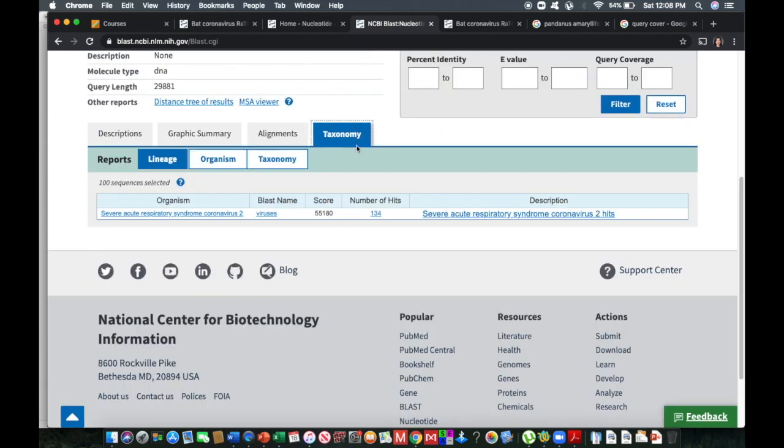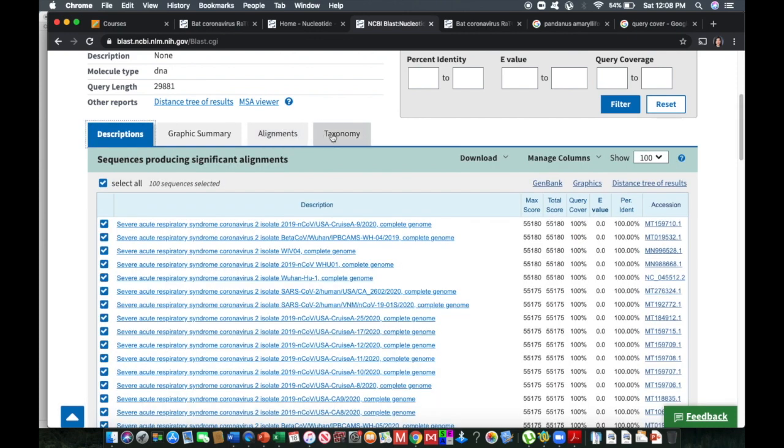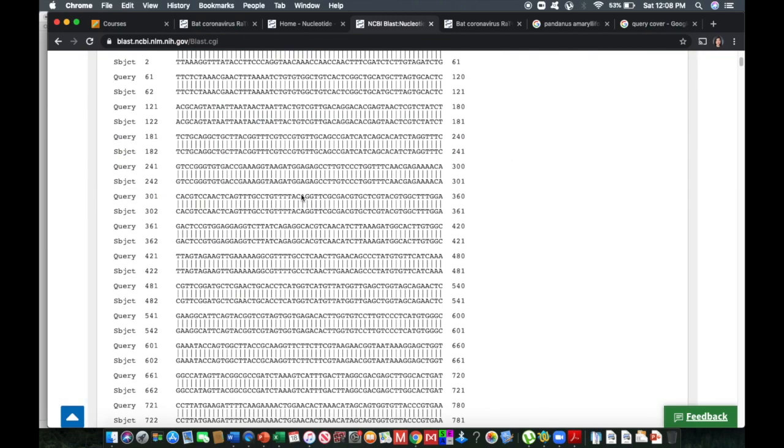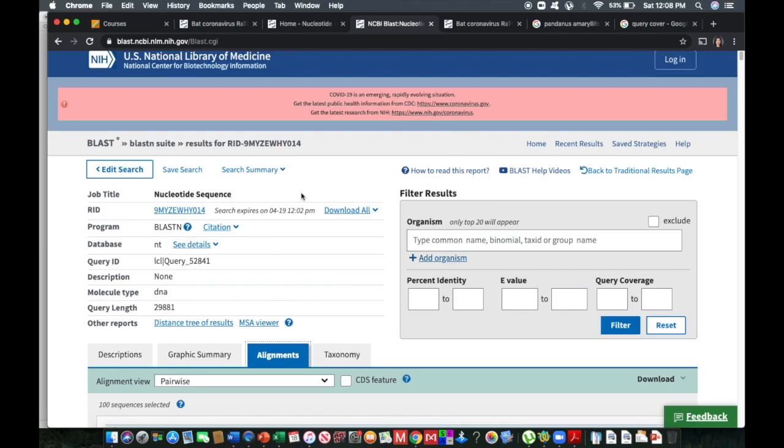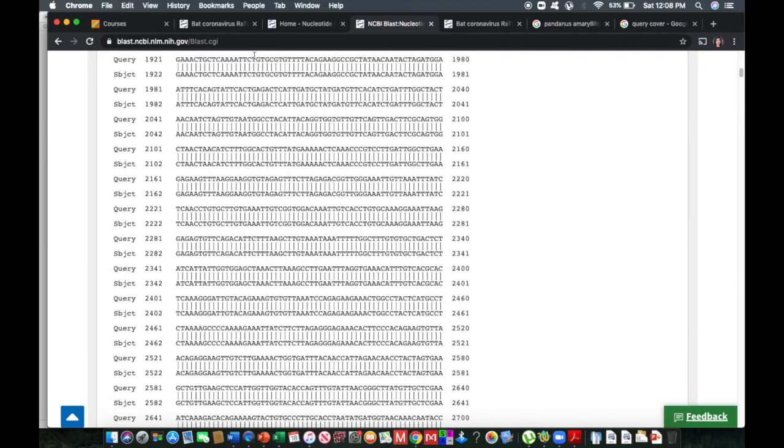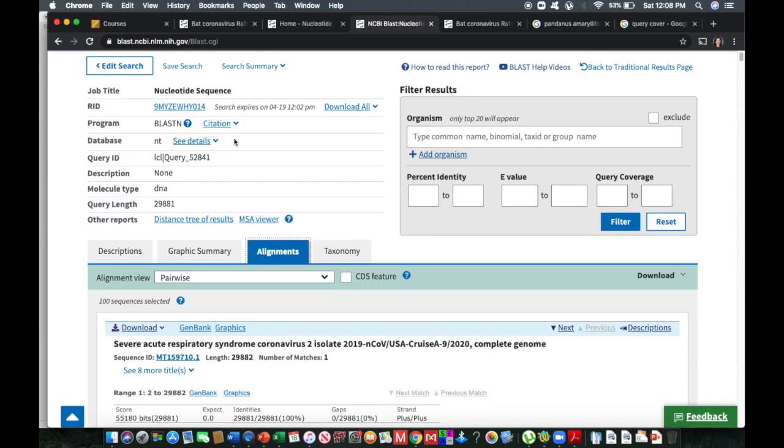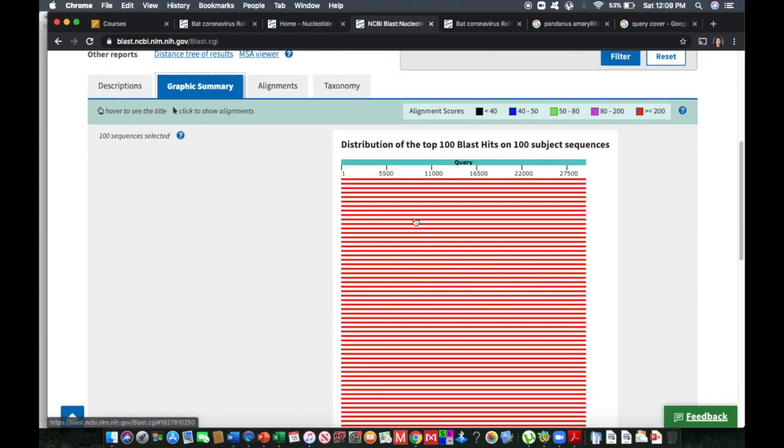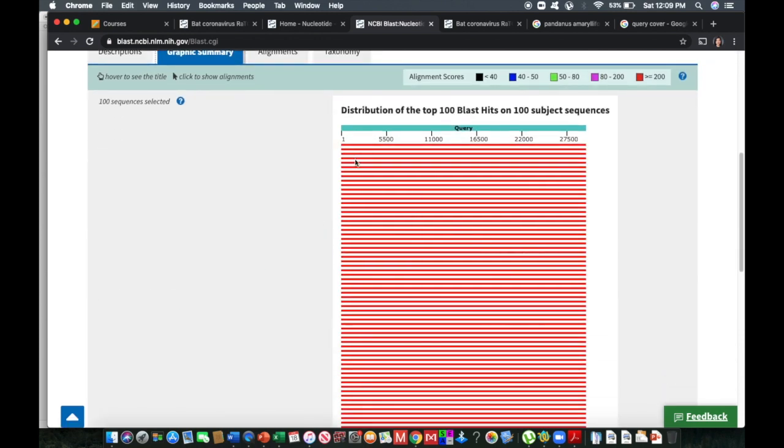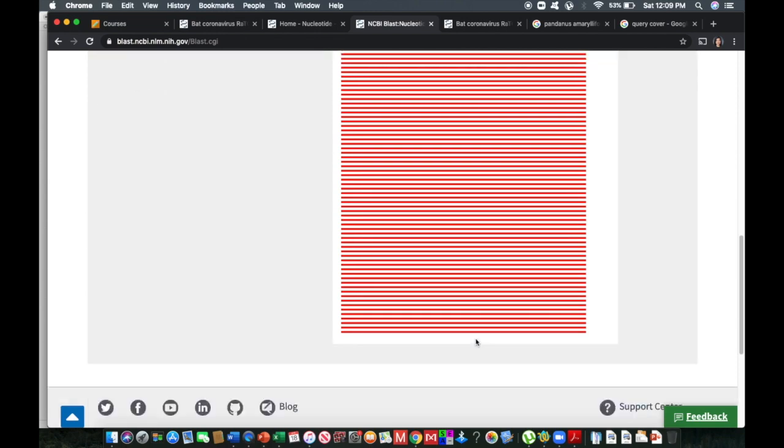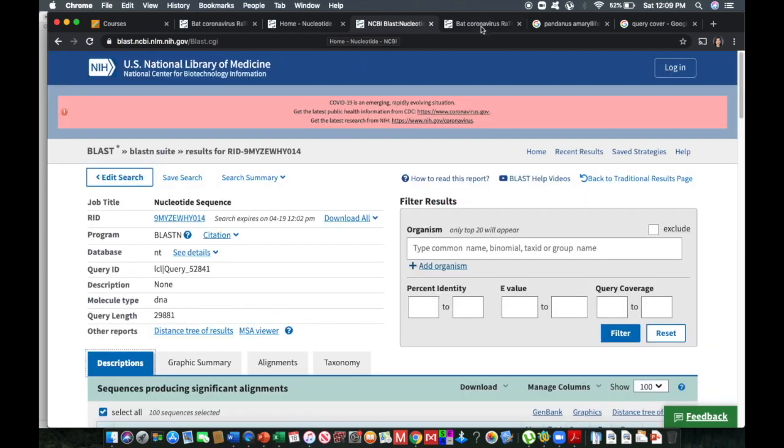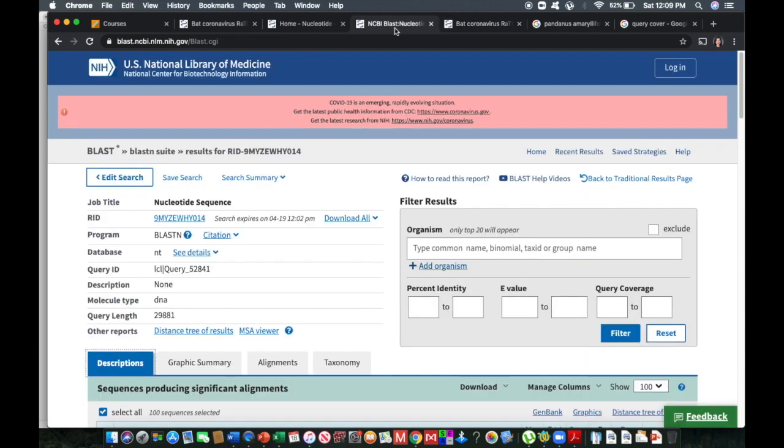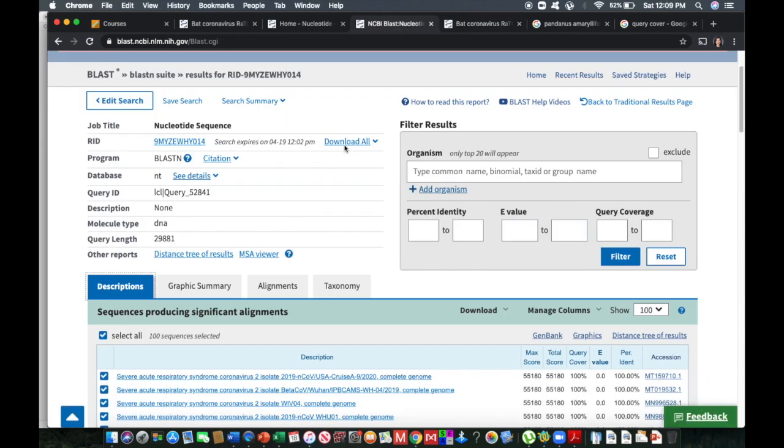If you hit on taxonomy, it will show you on the 100 sequences that were selected to be the highest to be identical to the sequence that you have searched. The hit is that it is a severe acute respiratory syndrome coronavirus 2. So it's a virus here for its BLAST name and the number of hits is 134. So it is the alignment of what you have searched, a graphic representation of the distribution on the BLAST hits of the sequences.